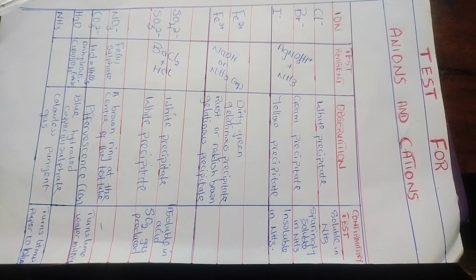Now let's go to the nitrate ion. It's just one test, for which we use ferrous sulfate. You are going to observe a brown ring at the center of your test tube. That's the test for the nitrates. Brown ring, nitrate, that should be at the back of your mind.